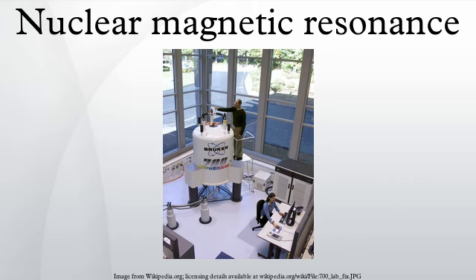Non-destructive testing. Nuclear magnetic resonance is extremely useful for analyzing samples non-destructively. Radio waves and static magnetic fields easily penetrate many types of matter and anything that is not inherently ferromagnetic. For example, various expensive biological samples, such as nucleic acids, including RNA and DNA, or proteins, can be studied using nuclear magnetic resonance for weeks or months before using destructive biochemical experiments. This also makes nuclear magnetic resonance a good choice for analyzing dangerous samples.